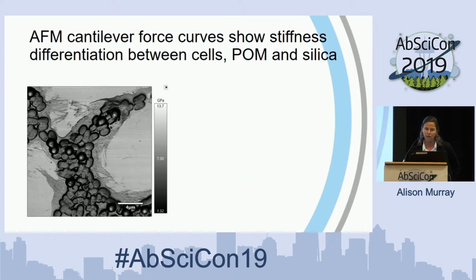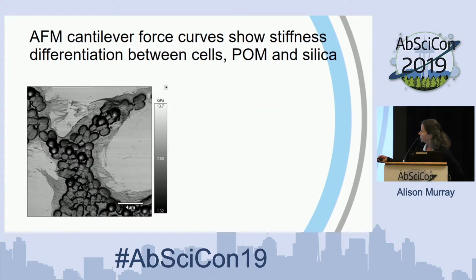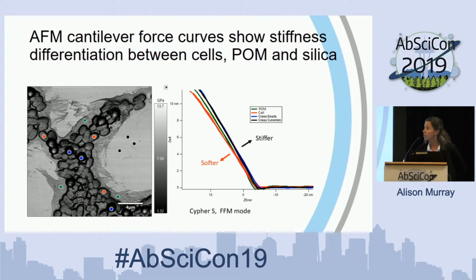So we have also been interested in asking the question, can we discern biosignatures from abiotic particles using AFM based on their nanomechanical properties? This is an image that we collected where we mixed silica beads. So the round features, which you may or may not be able to see, are silica beads that we mixed with bacterial cells.